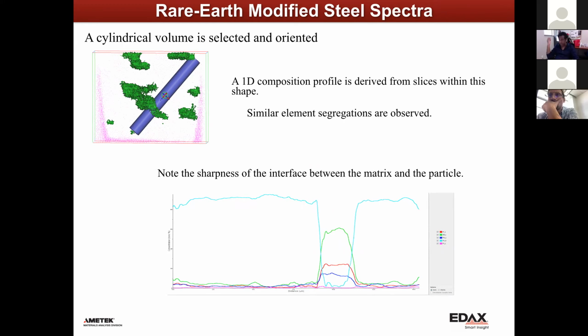The program gives you that option on the fly, which means that if you have already done a reconstruction and your instrument is still continuing with collecting the data sets, you can take the previously processed data set and do this analysis on the fly. And if you feel that, well, this is not going good, you can stop it, redesign your experiment, or prepare your samples and continue with this. Or if you feel that the results are really good, you can continue doing your experiments and the data collection, and it automatically gives you the results as you sit there collecting the data. So this is something really good.